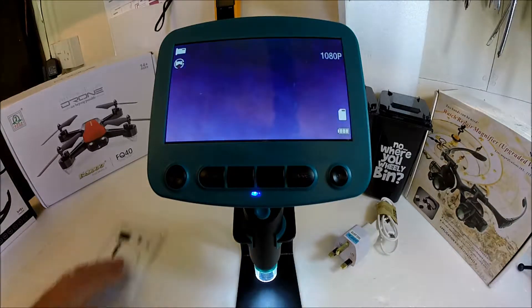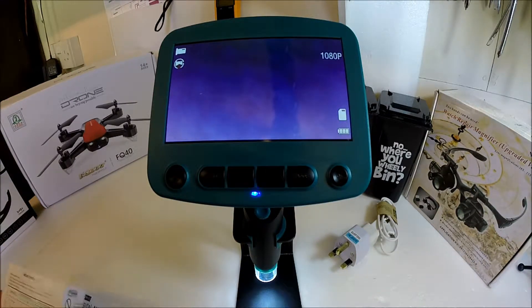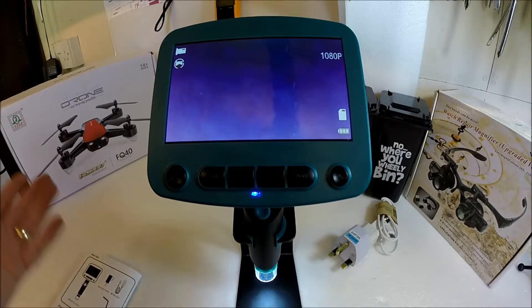It's a DM1 microscope from, I believe, a company called YH Tech, and you can get these from Banggood or other places.